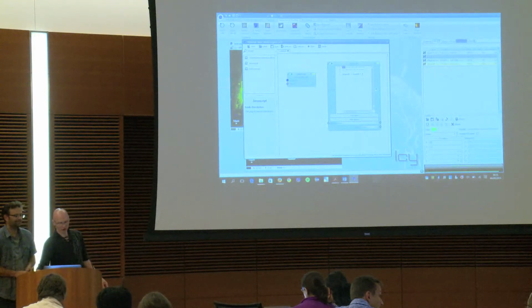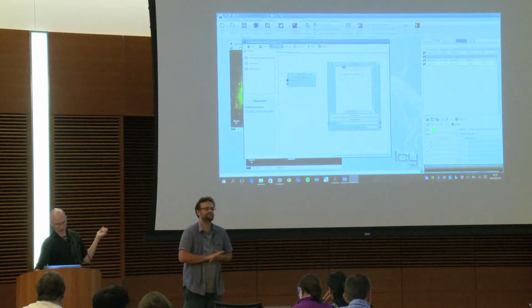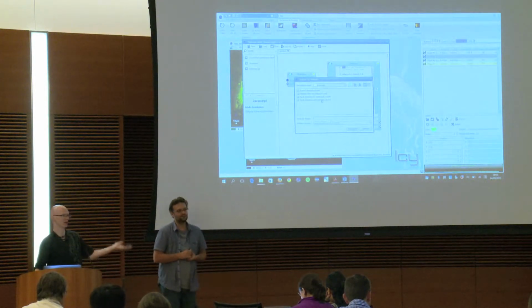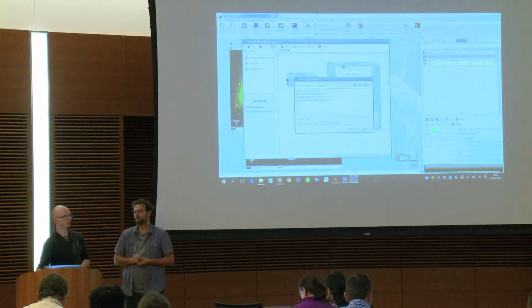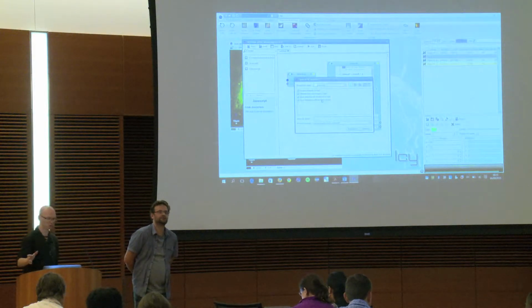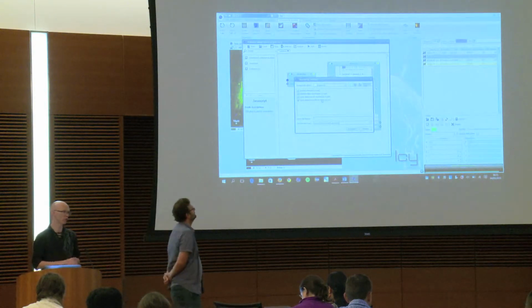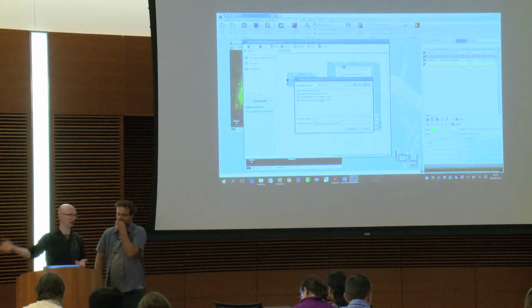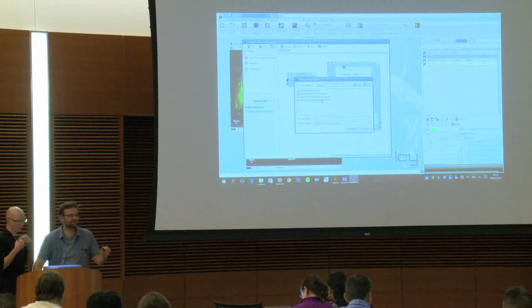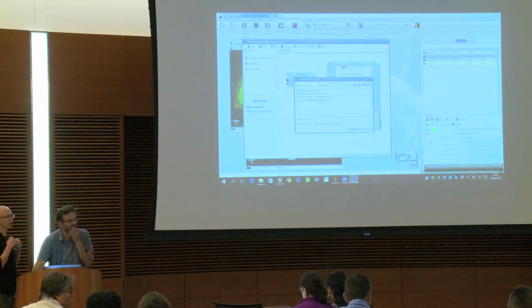To save the workflow? Yeah. When you save it, it generates an XML file. It's just an XML file that you can exchange with someone else, and then if you try to load the XML file on another computer, which doesn't have the necessary plugin, for instance, it will install it automatically for you. So normally you will be able to execute any protocol on any other computer without any problem. Okay. But if the question is, can you generate it? You can also do it programmatically. Yeah.